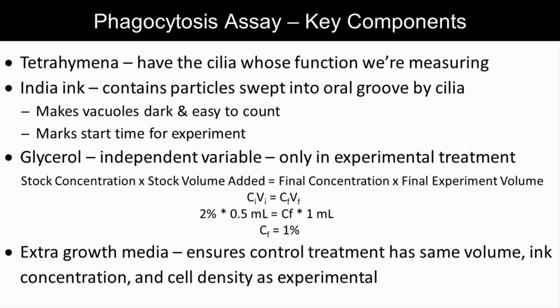Finally, why did I bother adding 500 microliters of extra media to the control? That's all about keeping the control treatment as similar to the experimental treatment as possible.